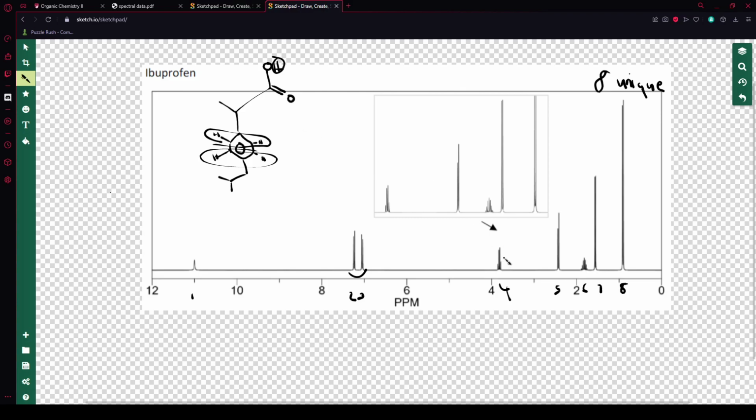And you can know that also that's going to apply to here, probably, because this is a methyl group that is affected by the electronegativity of these carbons. So it's going to pull the set of peaks further down the line. So you got to watch for that when hydrogens or carbons are close to very electronegative compounds. They're going to get moved down the line a little bit.